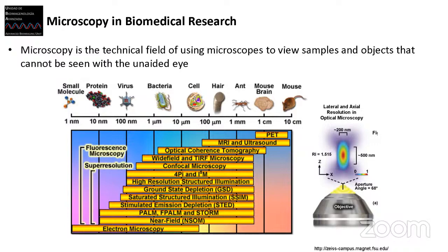of fluorescent microscopy. But basically, to summarize, nowadays we can go with microscopy from samples on the millimeter, centimeter scale down to the nanometer, and even more. In the last couple of months, there were papers where you can localize a molecule with an Angstrom resolution if you have enough photons, and if you have something bright that can give you, from the same point, enough photons. So microscopy has become the really fundamental research infrastructure and technology for the discovery of new biology.